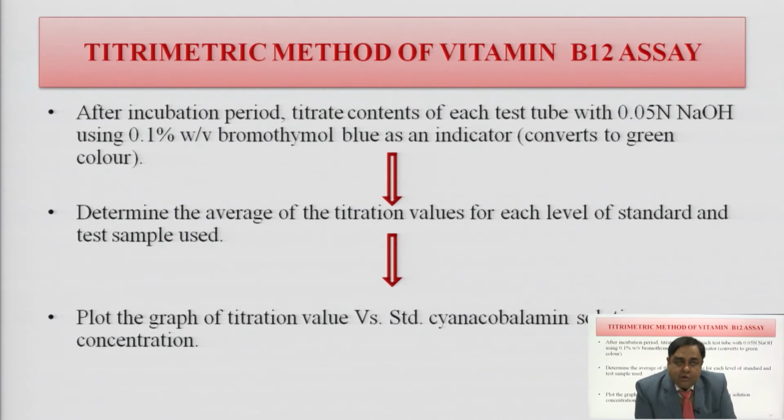Now, after incubation, you have to take out those test tubes and titrate the content of each test tube with 0.05 normal sodium hydroxide using 0.1% weight by volume bromothymol blue indicator, and at the end point there will be a change of color to green.